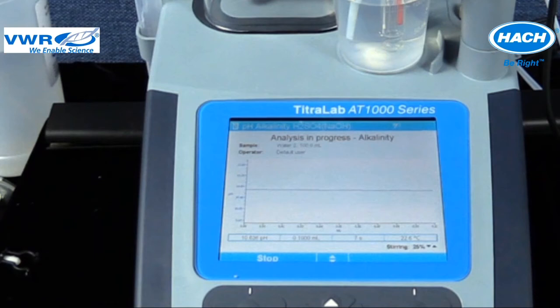The titrator software then advances to the real-time results screen and provides the following information. The displayed graph includes a left axis displaying pH units and what the electrode is measuring in the sample while the titrant is added. The bottom axis displays volume of titrant dispensed in milliliters.